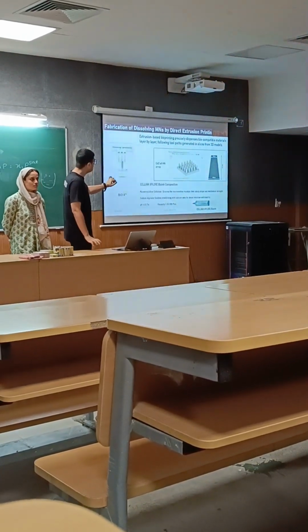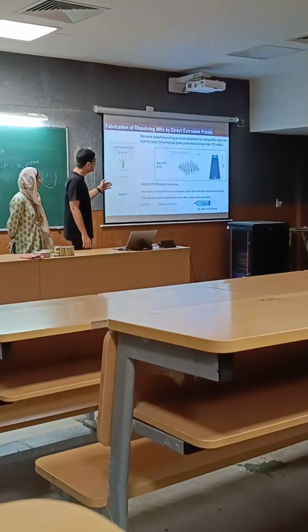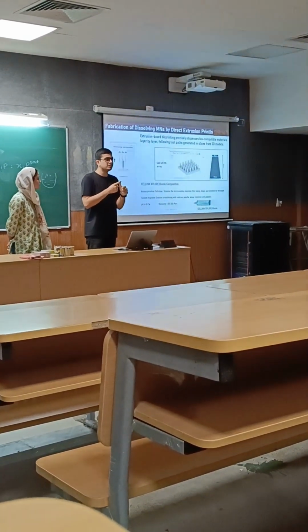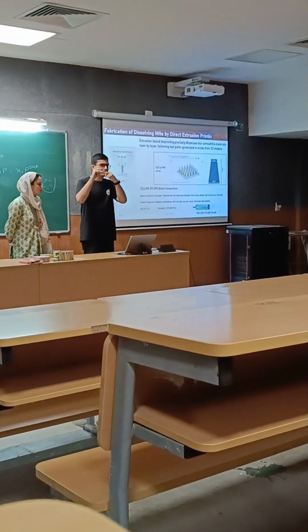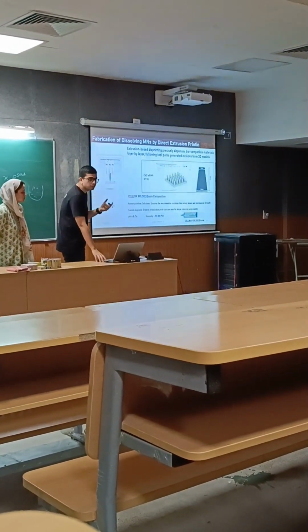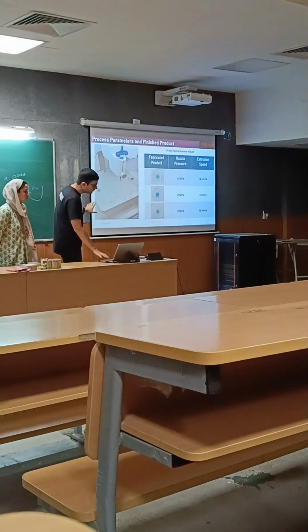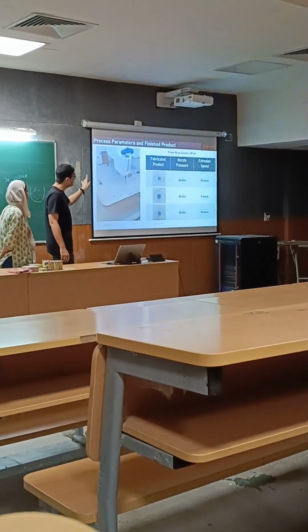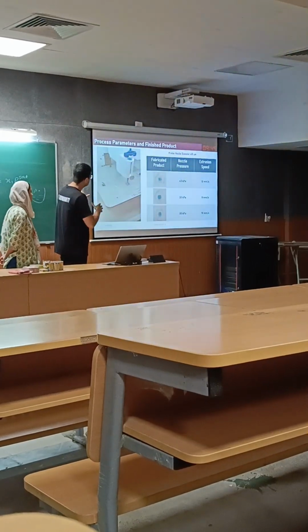And this is what we have used as the bioink. So we use a biocompatible material. Primarily you have nano crystalline cellulose, which is providing the mechanical support, as well as a sodium alginate base, which is also biocompatible. This is going to take time, but I'm just going to show you how this bioprinter is essentially printing this by extrusion.